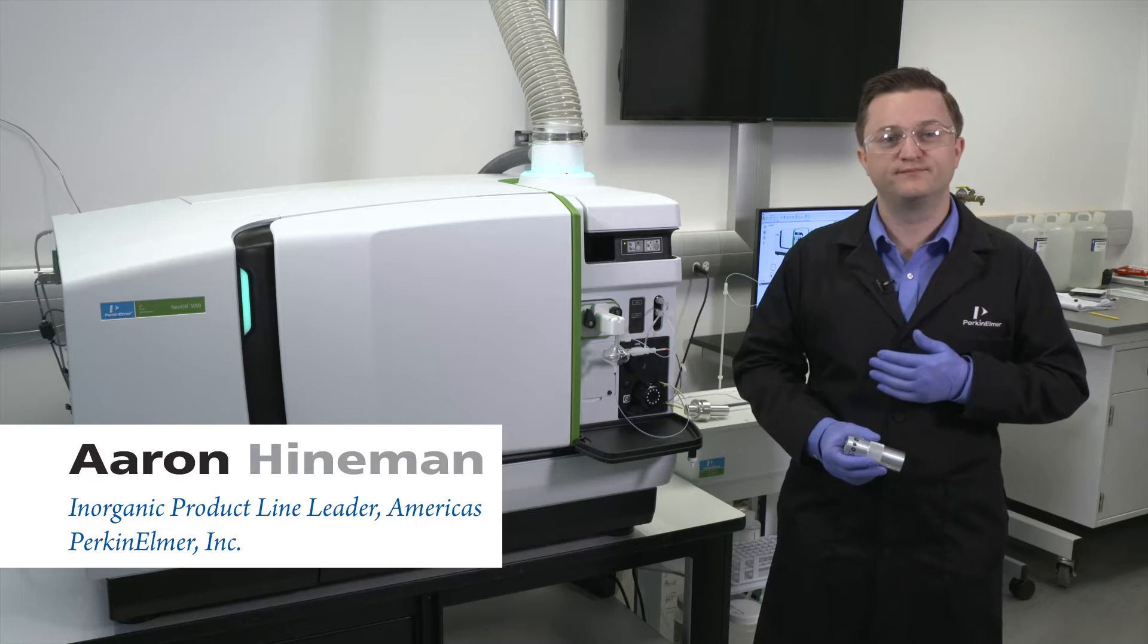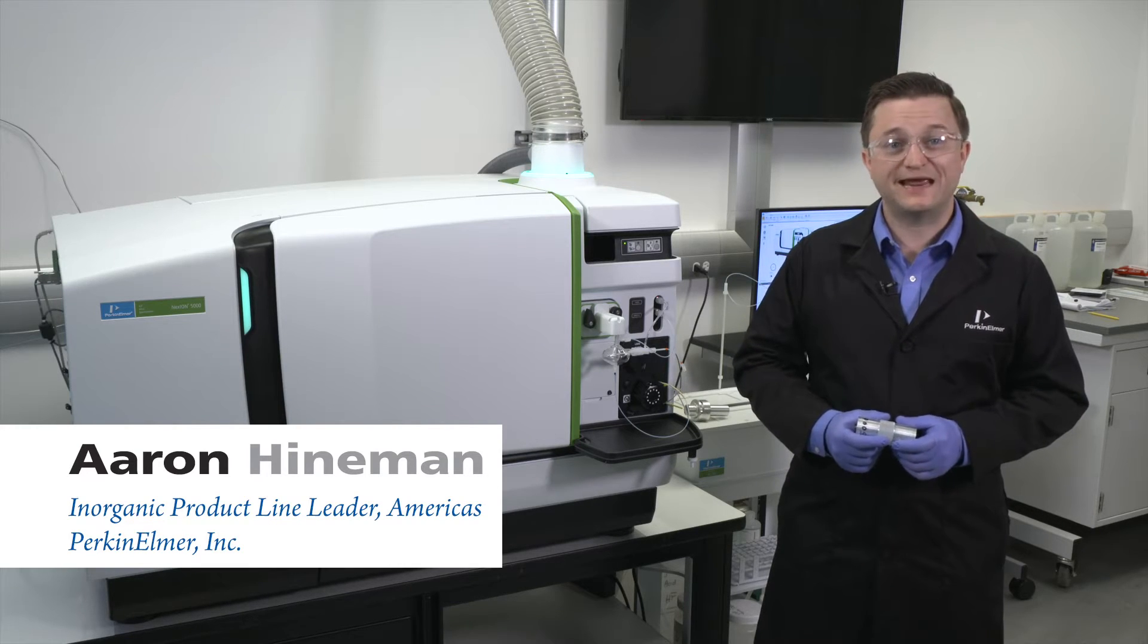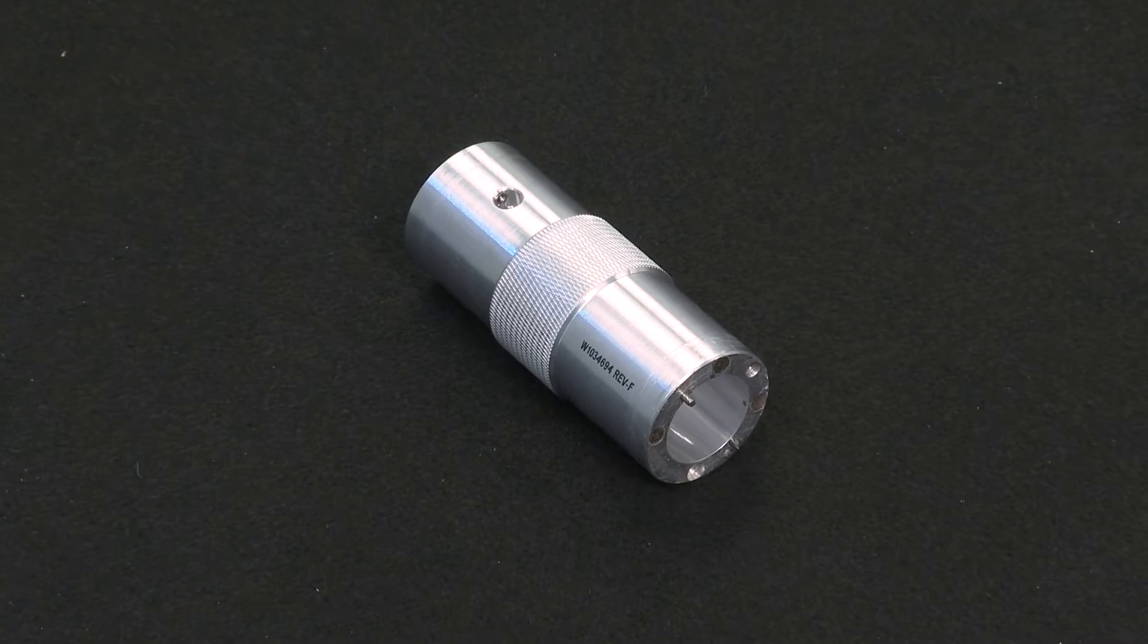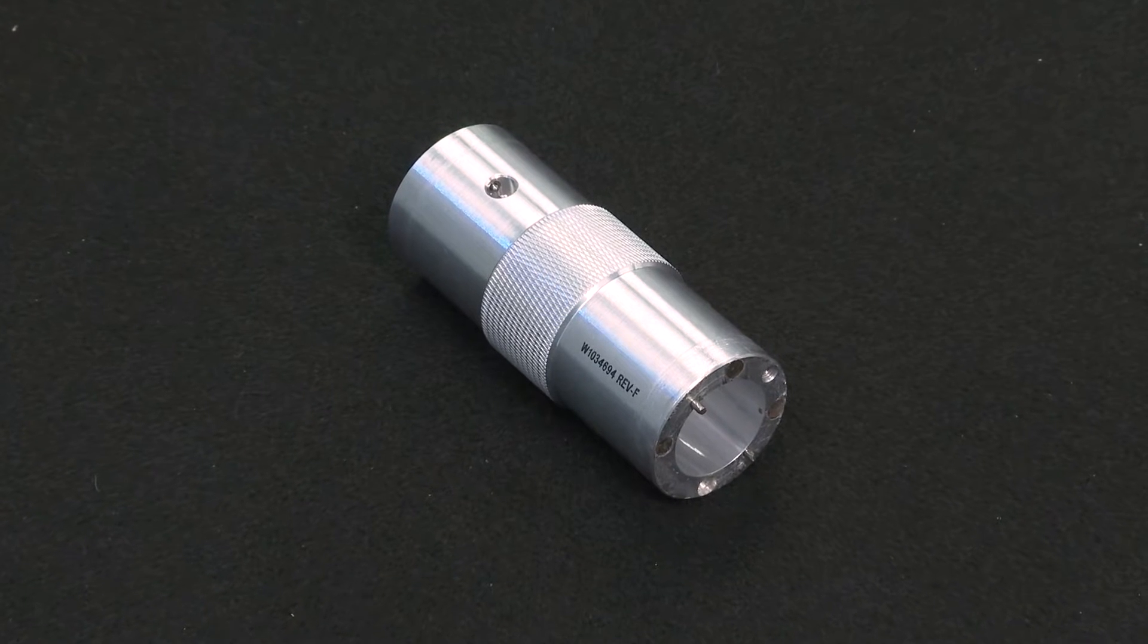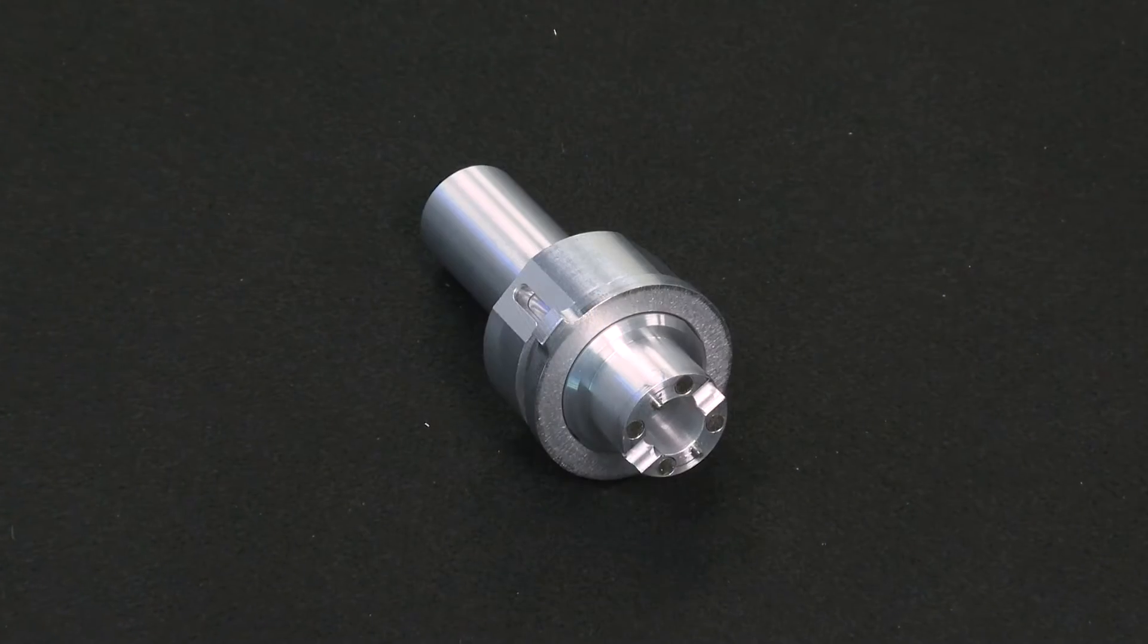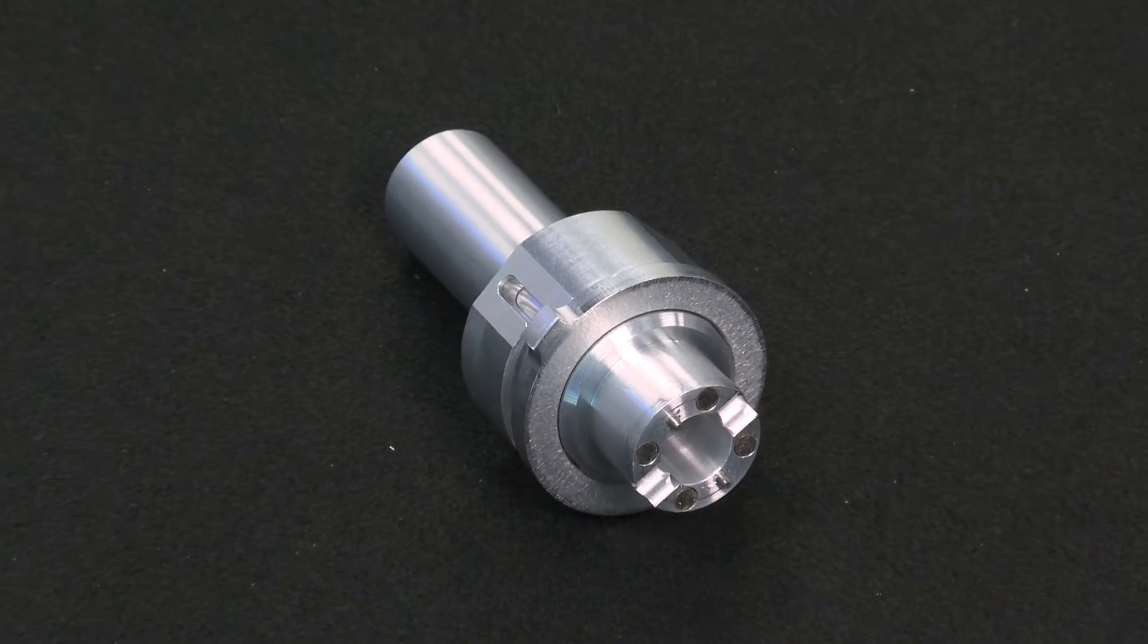I'm Aaron Heineman and in this video I will demonstrate cone access and removal from a Nexion 5000 instrument. The cone removal tool that was included with the instrument will be used for the sampler and skimmer cones, and then the hyper skimmer removal tool will be used for the hyper skimmer omni ring assembly.